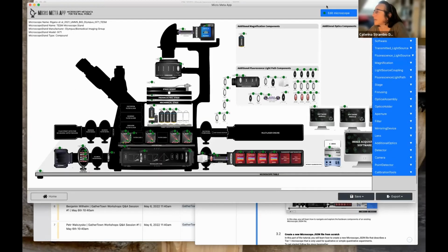As you can see, another thing I want to show you is these green dots. What are all these green dots? These green dots tell you that the information associated with each one of these components is validated, and it tells you here it's validated at tier 1. And you can also check if it's validated at higher tiers.